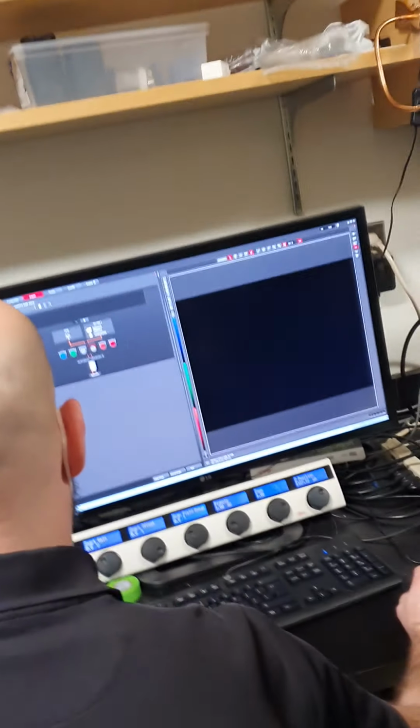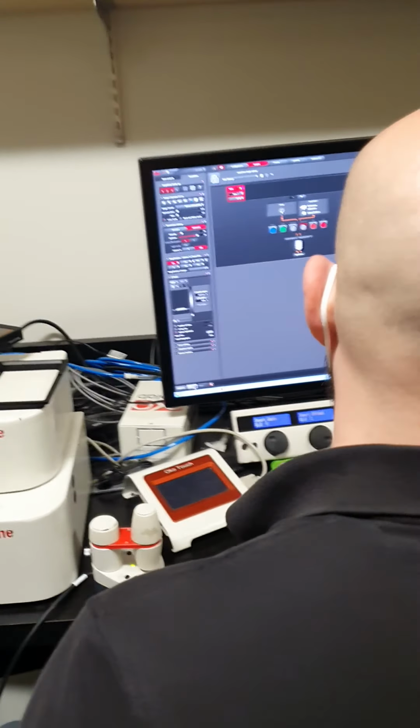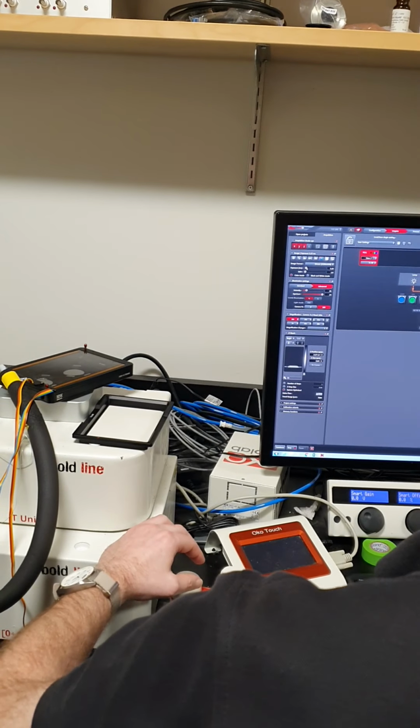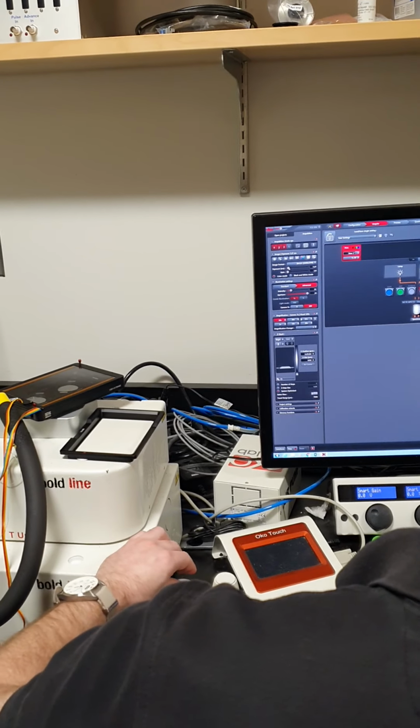Okay. Stop and live again. Okay, and now we can see our tissue. So we can see maybe we want to bring up the exposure a bit, and then adjust our focus.